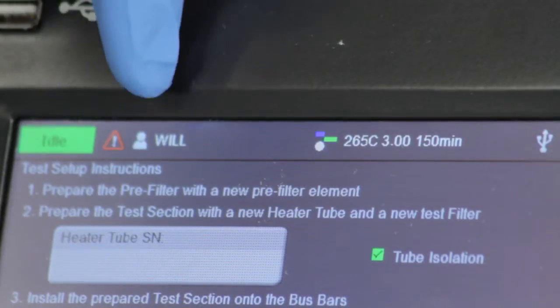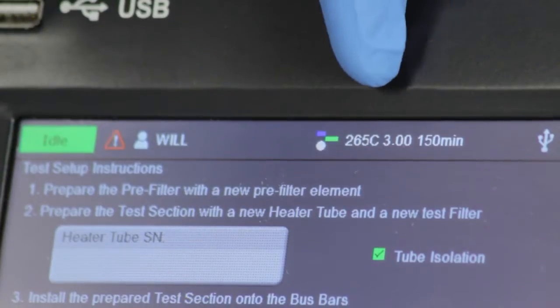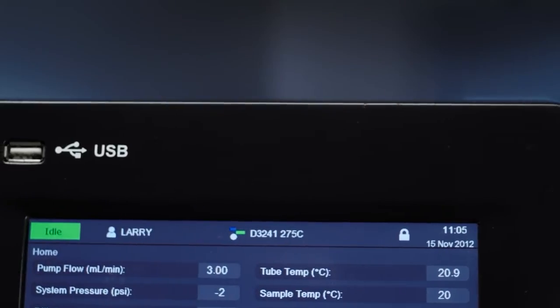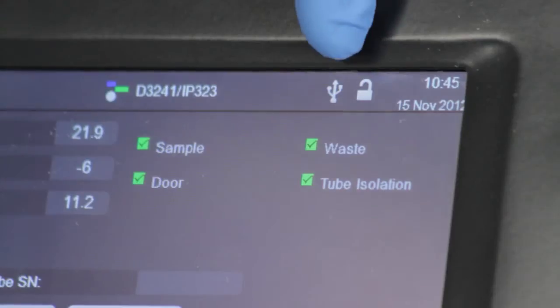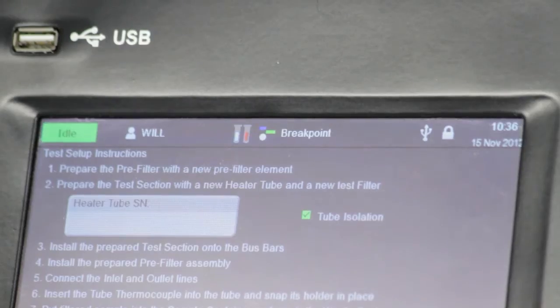It shows the current status of important information like the instrument state, alarm indicator, username, method name, activated external connections such as Ethernet or USB, user access including normal or service, and the system date and time.